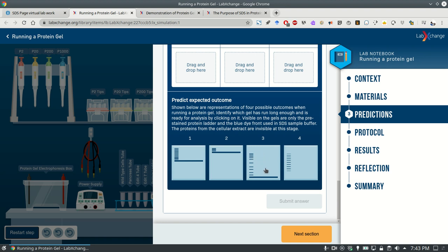Well, the other bands are invisible because you do not stain them. You can stain them after you're done with this electrophoresis if you want. Then you could see them turn as blue lines, just like this. Or you can not do that. You can stain them in some other way. The reason why we do not stain the other proteins is because, as many of you correctly observed in a previous lab report, once you add Coomassie blue, it's very hard to go back. It's very hard to take the Coomassie blue out.